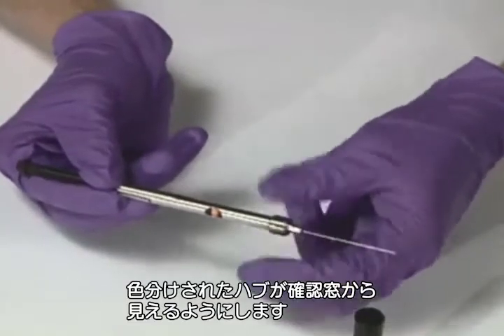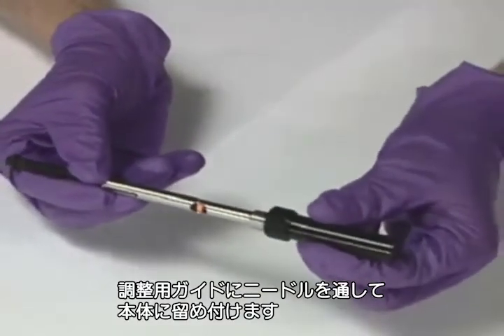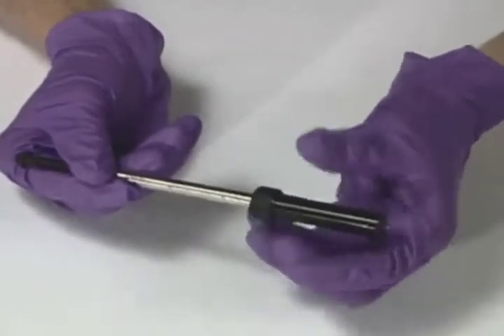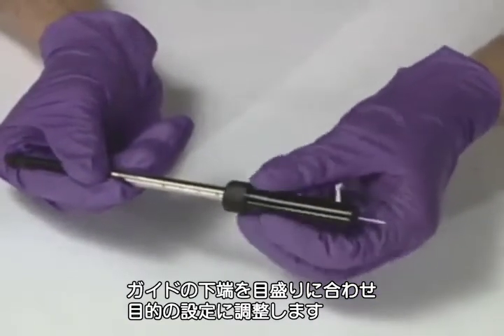Note the color-coded fiber hub can be seen through the opening on the barrel. Attach the depth guide by inserting the needle through the hole in the depth guide and screwing it onto the barrel. Set the depth guide by aligning the lower edge of the guide to the desired setting on the vernier setting on the side of the barrel.